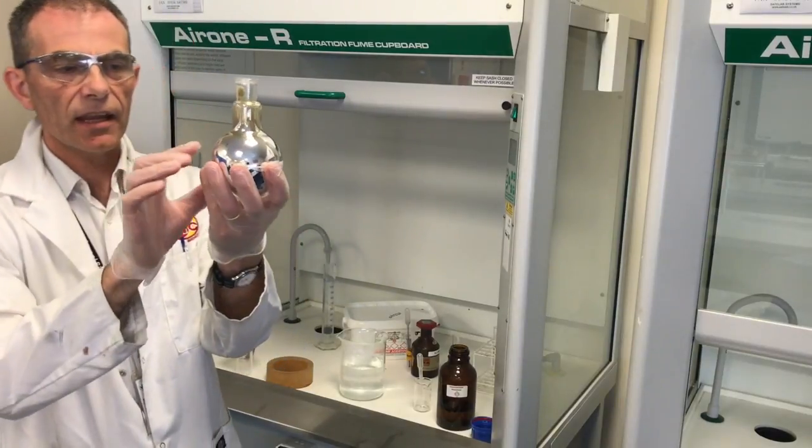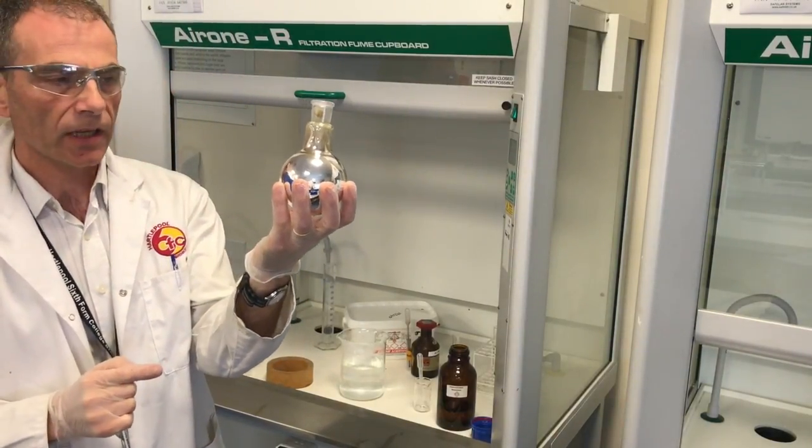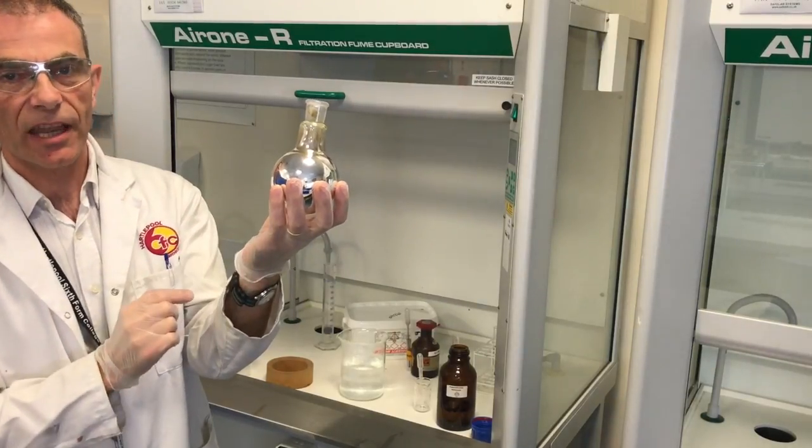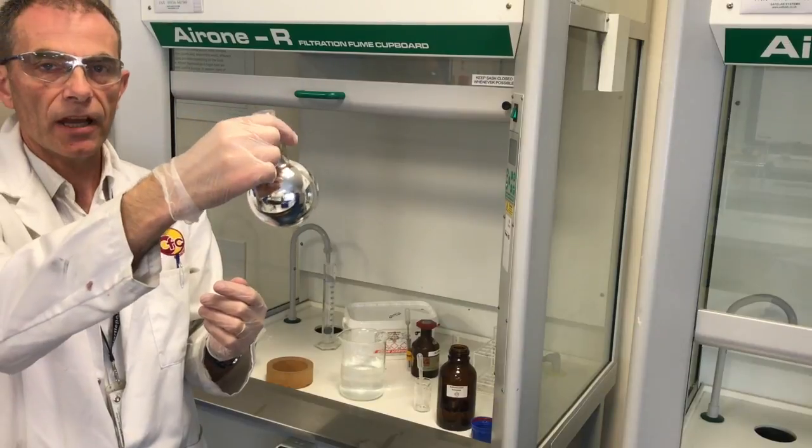One last thing: the contents of the flask need to be disposed of very quickly because it's potentially explosive. Silver fulminate could form, so I'm going to get rid of that now.